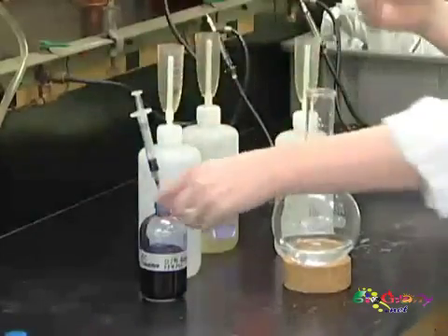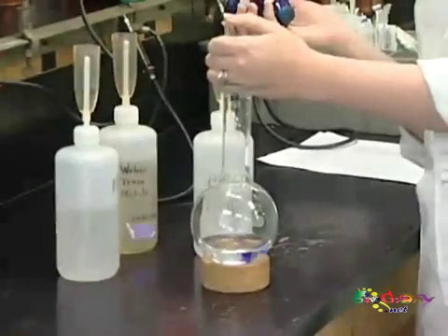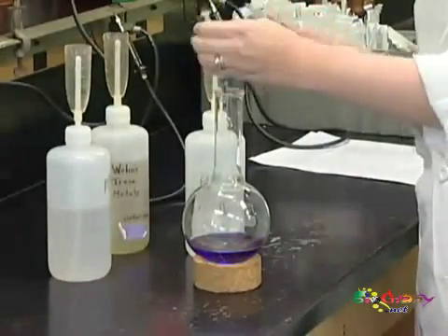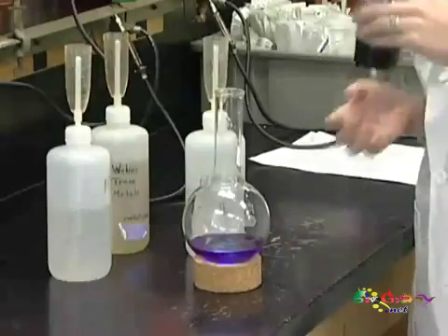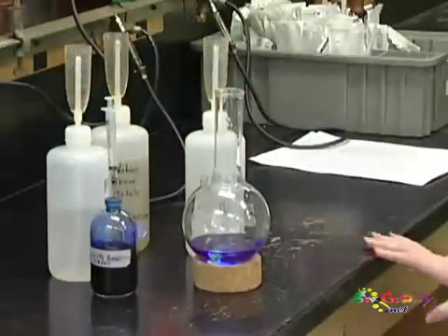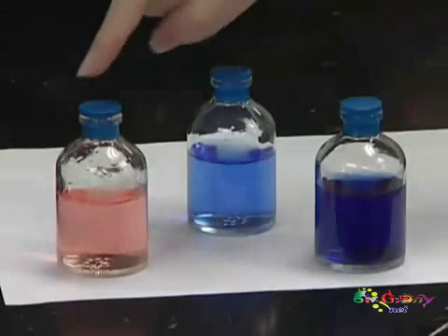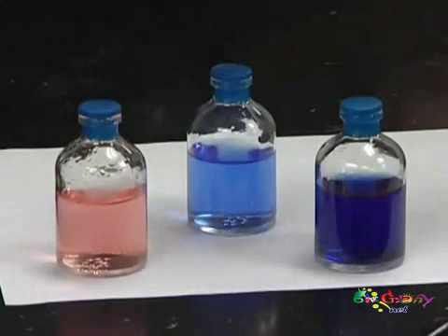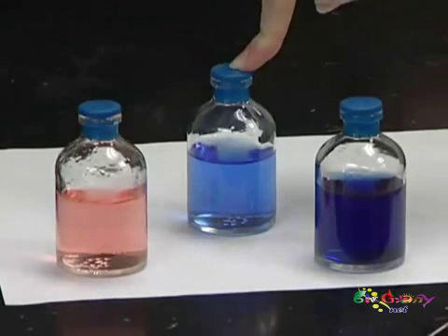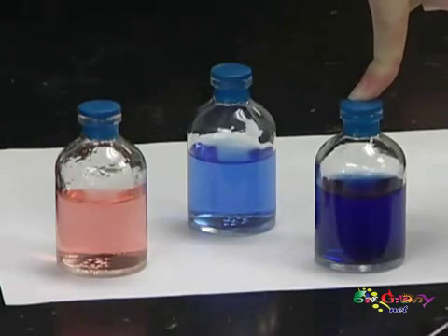I'm also going to be adding an indicator called Resazurin, which as you can see starts out blue. This will help us tell the pH of our media and later on whether or not we have any oxygen contamination. This media will be pink at an acidic pH, blue at a neutral pH, and a darker blue, if not sometimes cloudy, under basic pH.